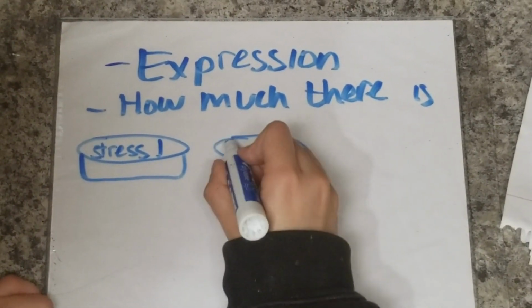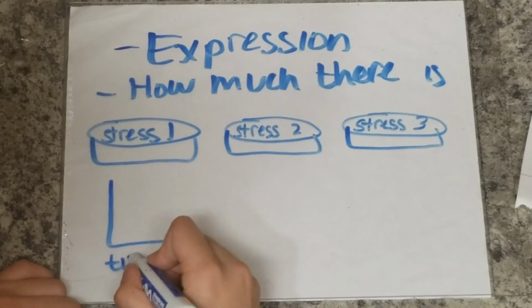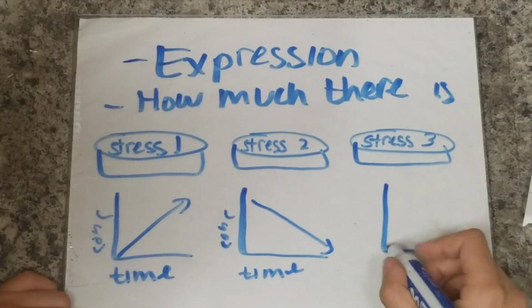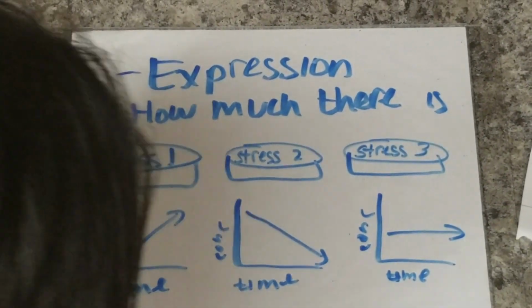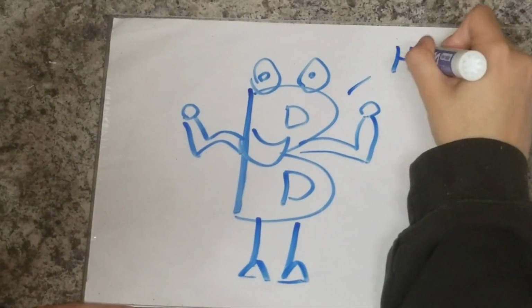For example, let's just say you were putting a cell under different stressful conditions and wanted to study whether the expression of a certain protein increased or decreased in that cell. You would need a quantitative assay that could track the protein's concentration with respect to time. In other words, a way you could track how much the protein was present. The Bradford Assay would save the day.